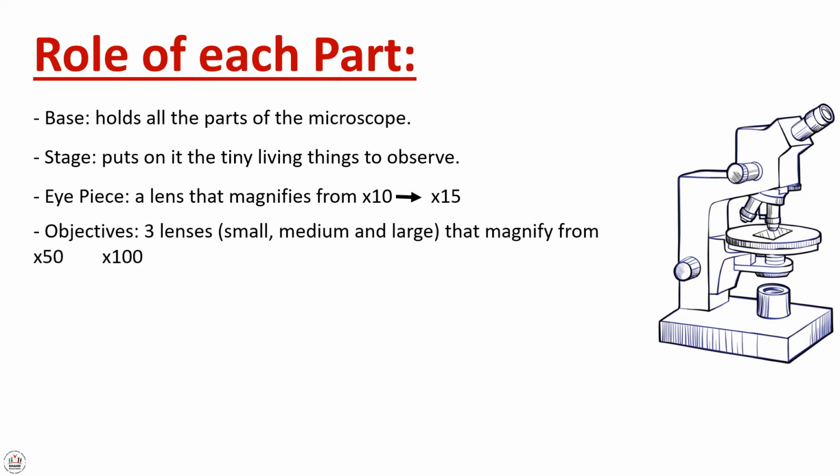While the objectives, 3 lenses, small, medium and large, that magnify from 50 to 100.